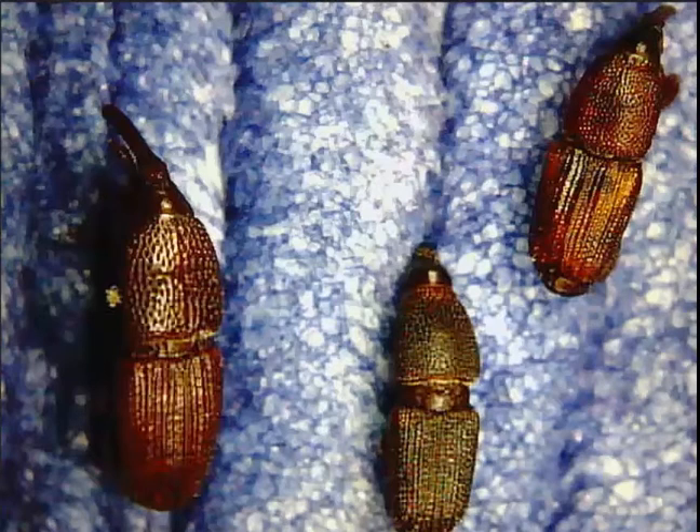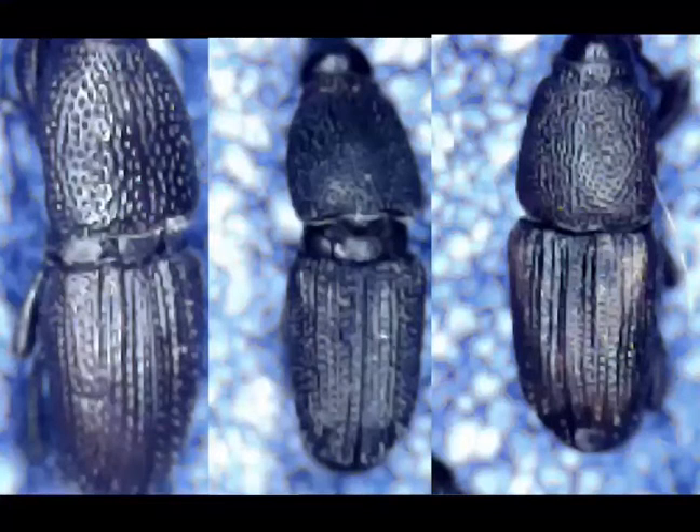One thing to note is that the background colour can have a marked effect on the colours that you see. Here's a different background, and the colours of the beetles change as the colour adjusts in the microscope. Also the type of microscope you're using can give quite different colours.